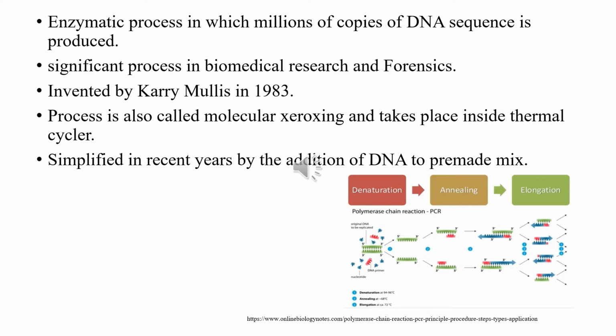PCR was invented by Kary Mullis in the year 1983. This process is also known as molecular xeroxing. This procedure takes place inside the thermal cycler. PCR procedures have been simplified in recent years by the addition of only DNA to a pre-made PCR mix.